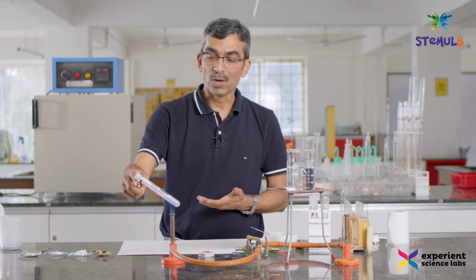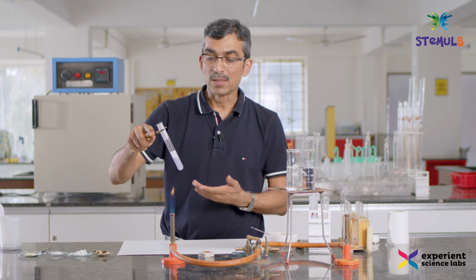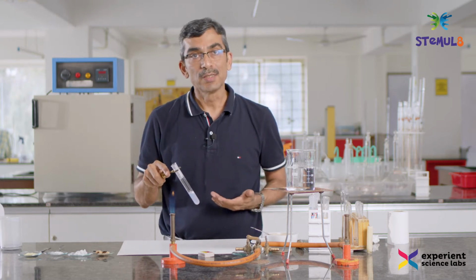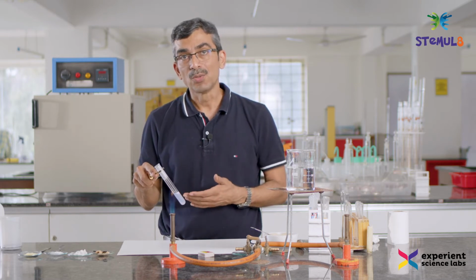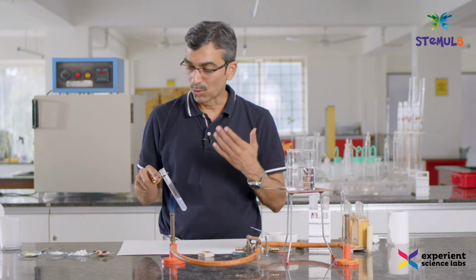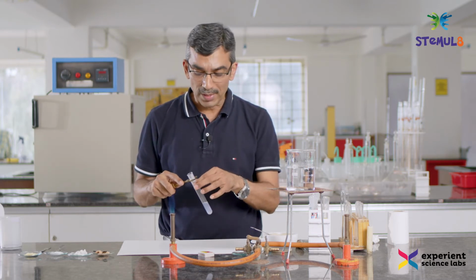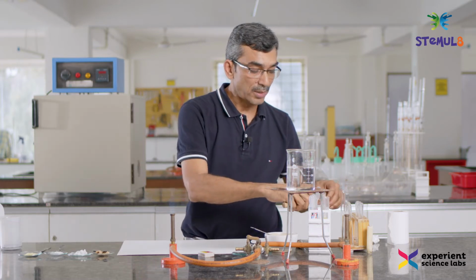So not denying that protein is there or is not there, protein is there, but we'll have to do a quantitative test to figure out the quantum of protein in rice vis-a-vis groundnut. Okay, so that kind of proves that rice also has protein. So let's move on to the next test, which is testing the sugar.